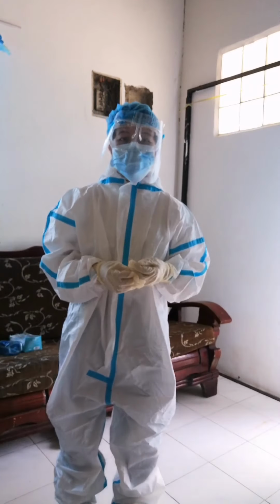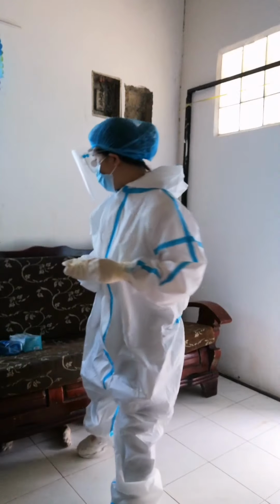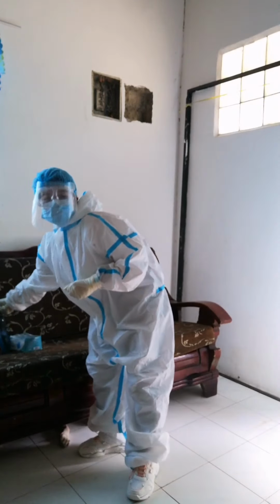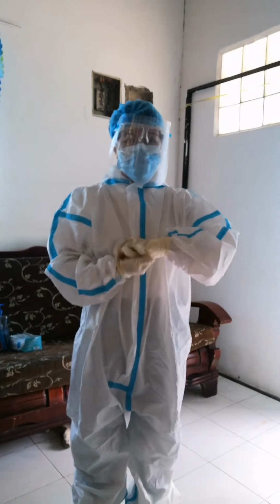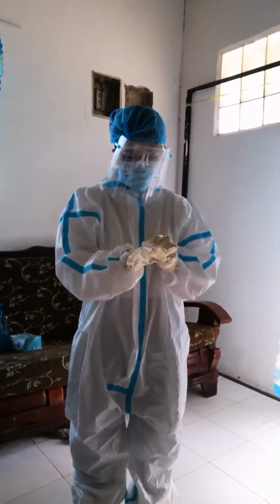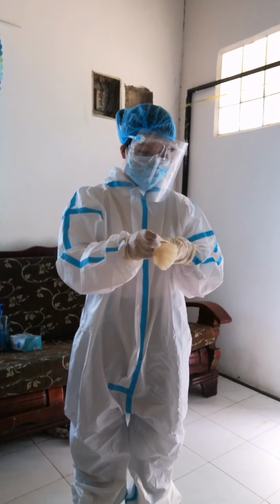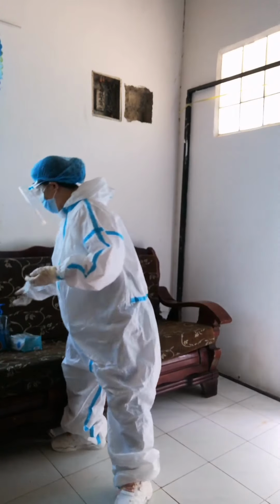So next is to doff the first layer of the gloves. This is mainly to prevent the transmission of microorganisms to the other parts of our PPE. After removing the first layer of the gloves, we must perform hand hygiene.